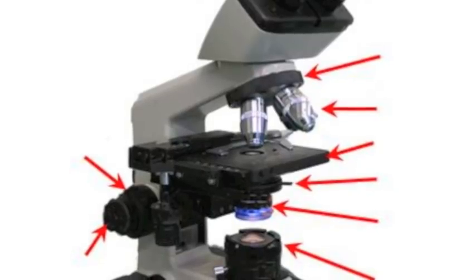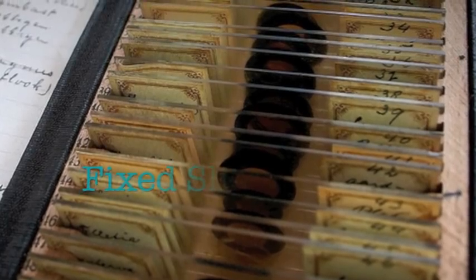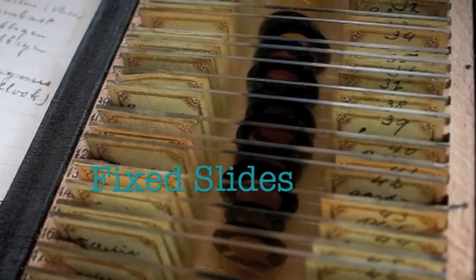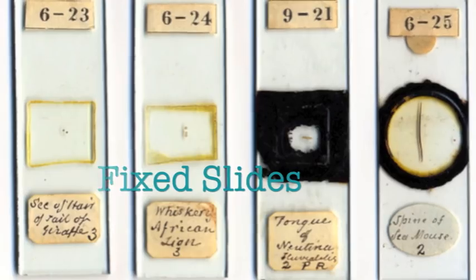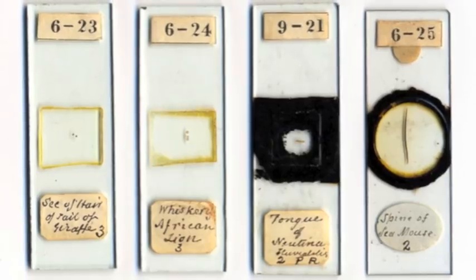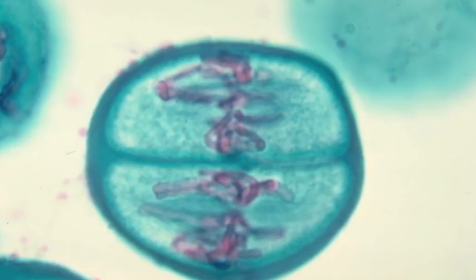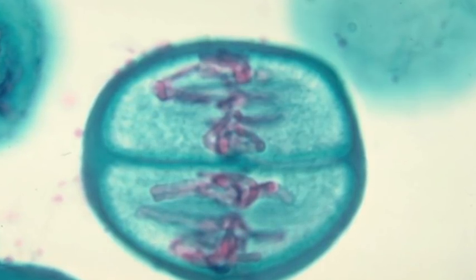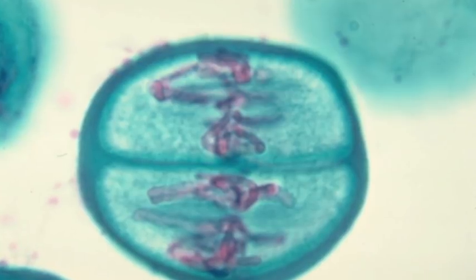To do so we'll need microscope slides. Sometimes these slides are permanent or fixed. The specimens in these slides have all been preserved and often stained or dyed so that we can see certain parts of the cell better. In this slide the chromosomes have been stained pink.